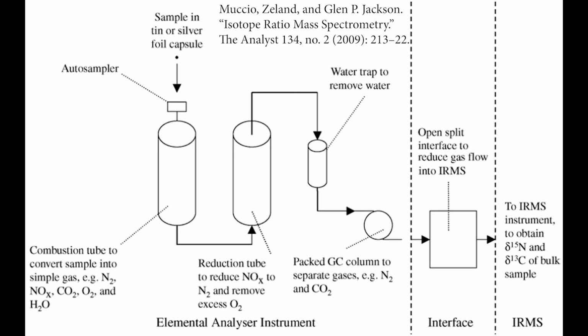Now, if you have organic compounds, carbon, hydrogen, nitrogen, oxygen, and you want to break them down into their constituent elements, you don't need a torch as hot as the sun. You don't need an ICP torch. You don't need a thermal ionization filament that's going to 2,000 degrees. You can just burn them up, all right? You can just combust them.